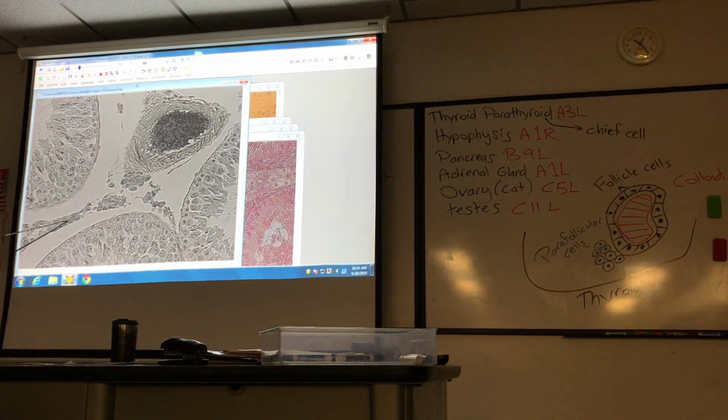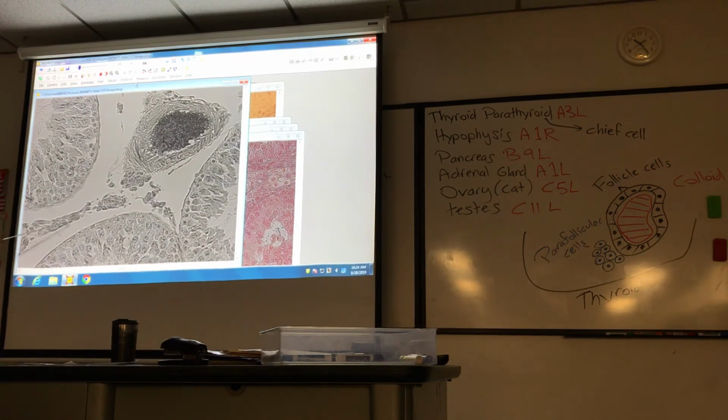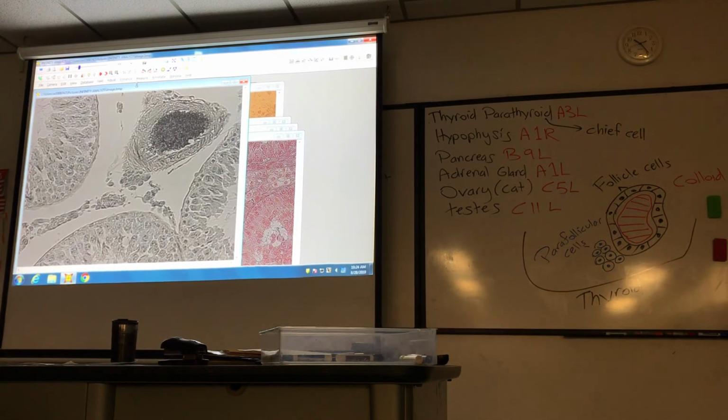What if I said identify cells? Interstitial cells, that's it. It's pretty easy. Histology quizzes aren't that hard, actually, if you take some time with the slides.